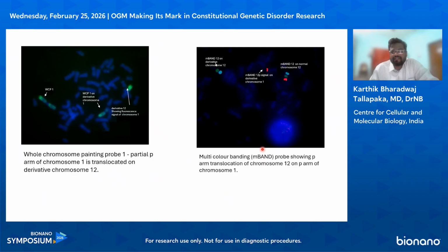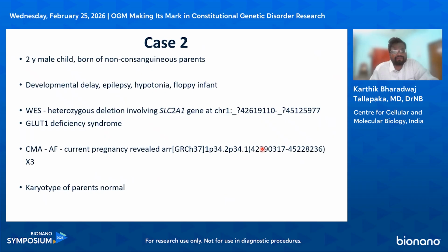This is additional FISH experiments using whole chromosome paint or multicolor FISH, multicolor banding to confirm the hypothesis that we had on the complex translocation.